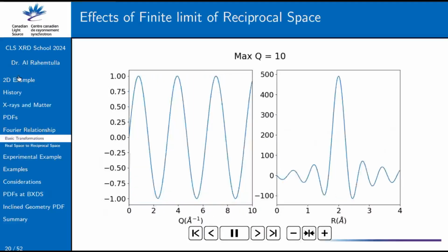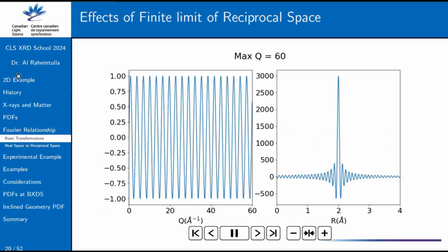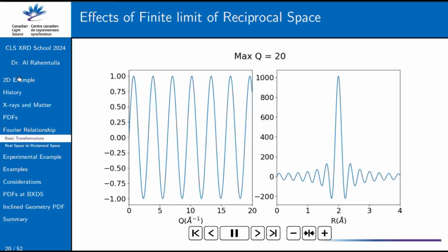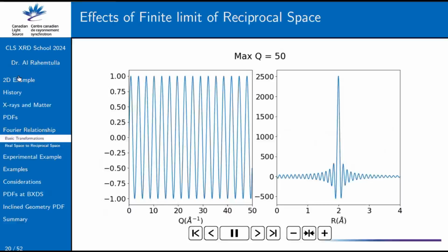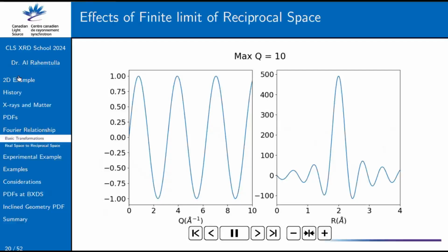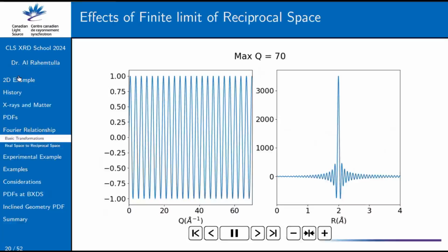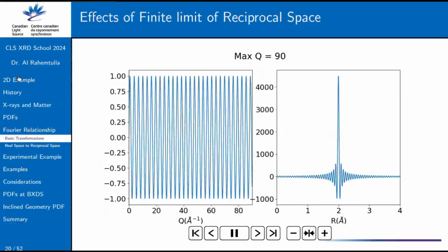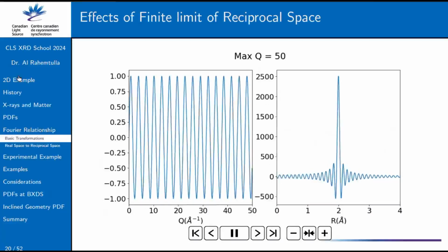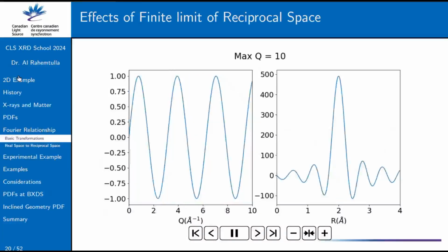For example, for identification, if I had two amorphous materials and just wanted to compare them, they would have to be very different because of the broadening that you would get. Also, you would need a background subtraction if you managed to collect that in your XRD measurements. I would say it's worth a try, but it's very unlikely that you would get something useful. Usually, I would say 20 inverse angstroms is about the minimum I would go for a PDF if you wanted to work off of that.